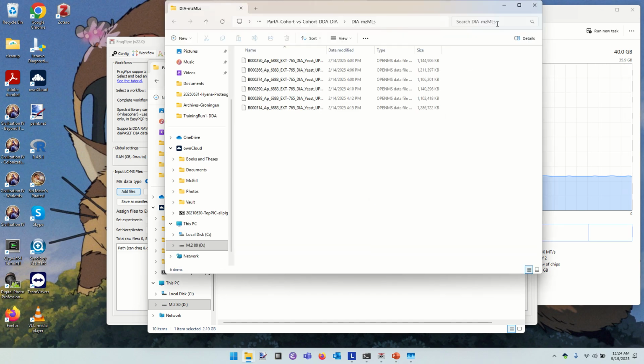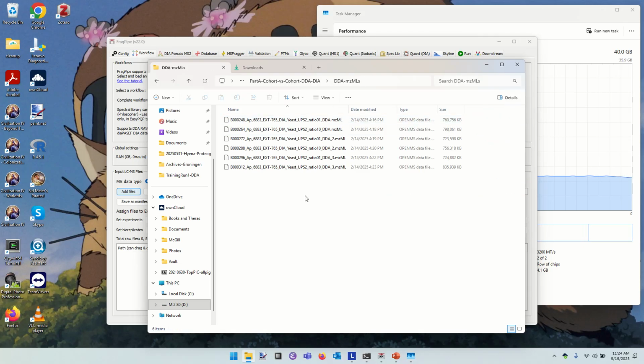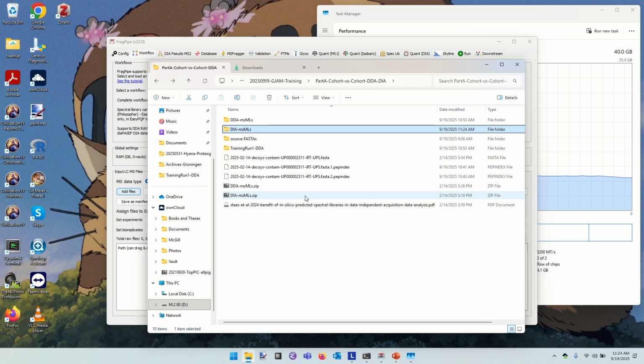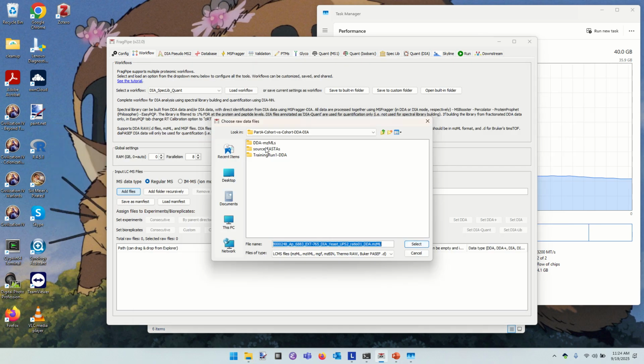Okay, so now we have new files. Originally, the DDA ones were about 3/4 of a gig apiece. These are a little bit more than a gig apiece, which is why I gave them to you as zip files. All right, I return to FragPipe. I want to refresh this directory. I want the DIA mzMLs.